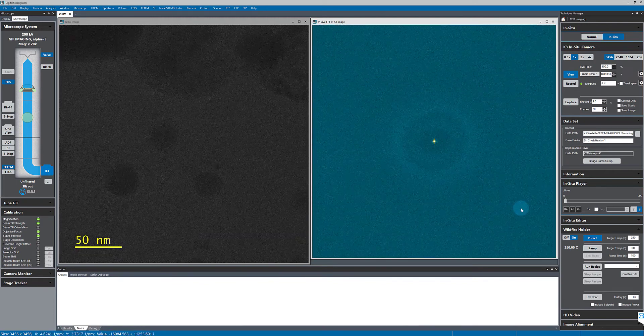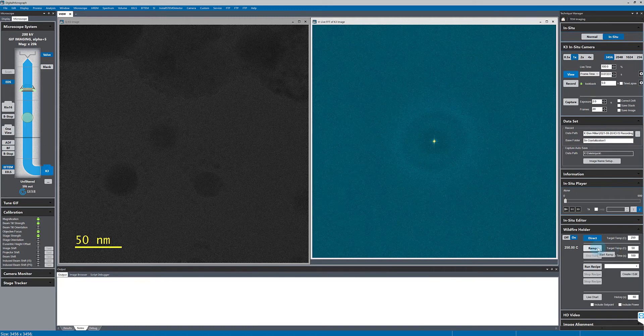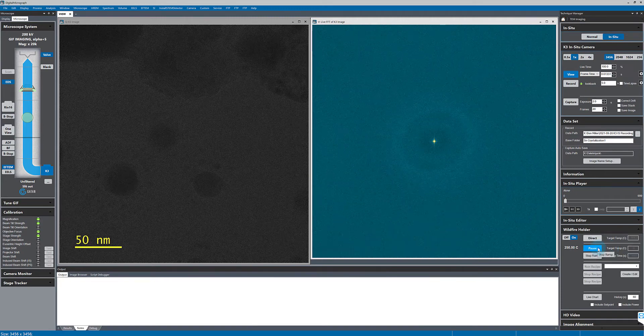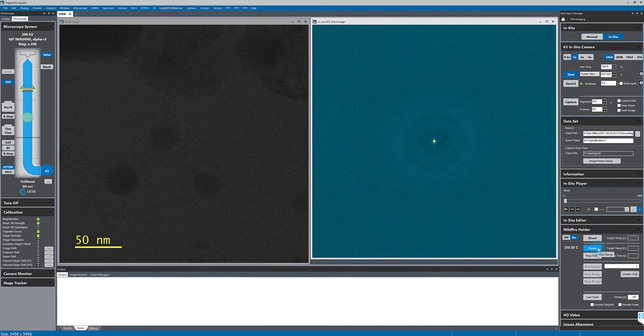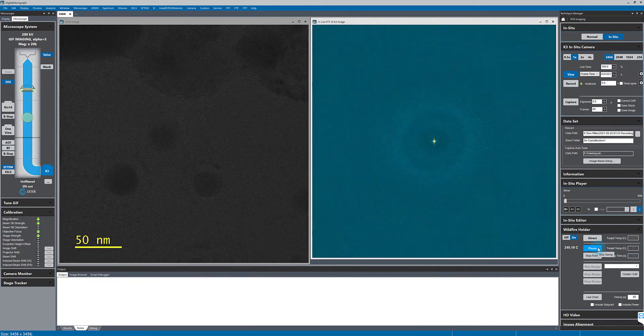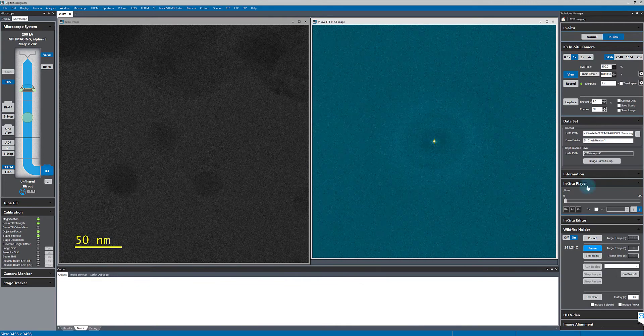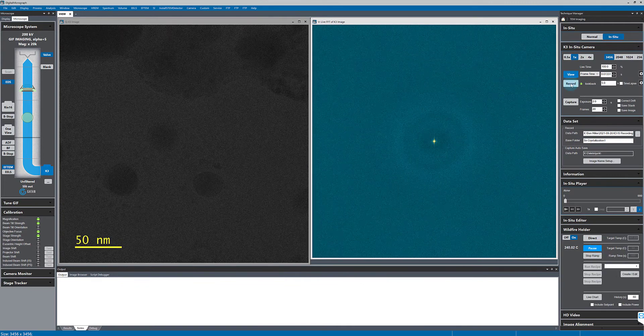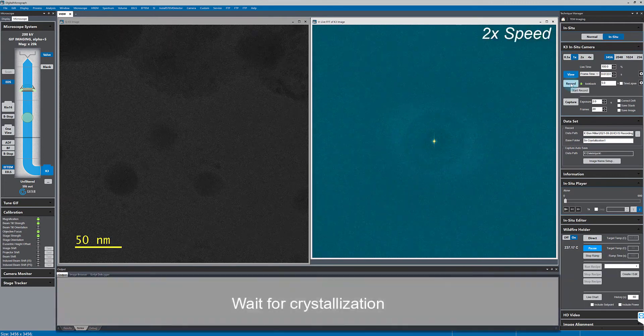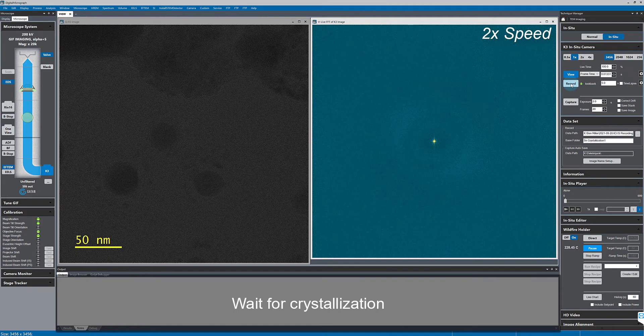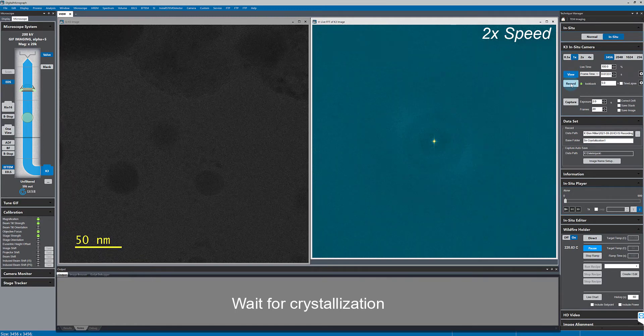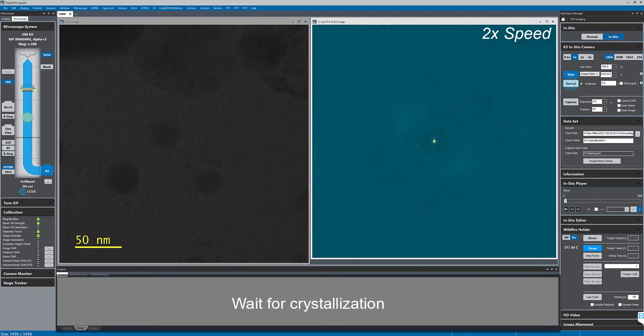Now, I'll start the temperature ramp. I'm ramping down to 50 degrees over 100 seconds. And I've sped up the video playback here as nothing really interesting is happening.